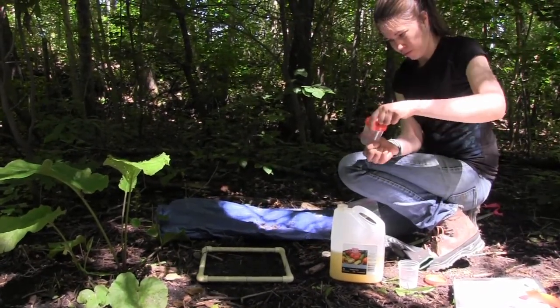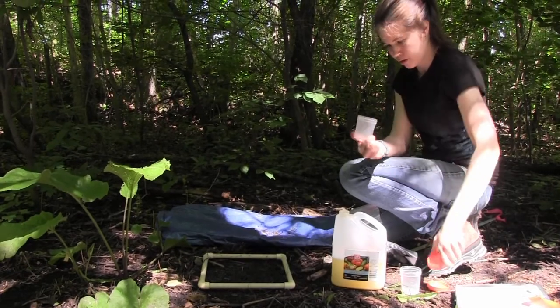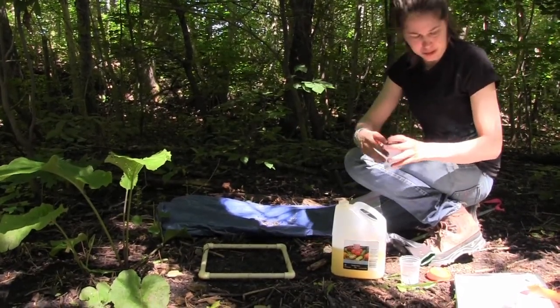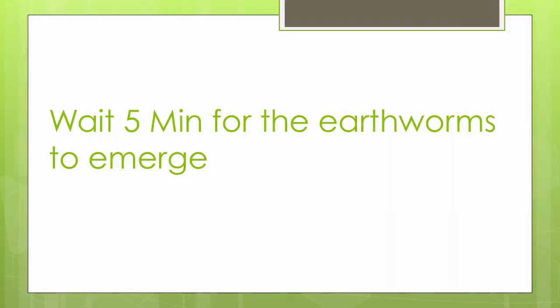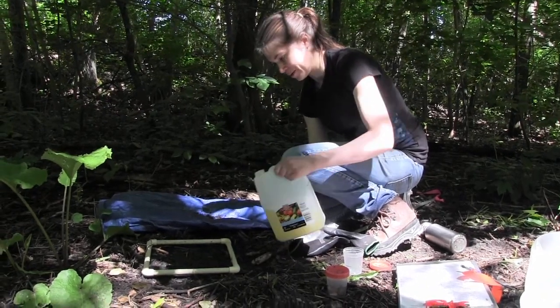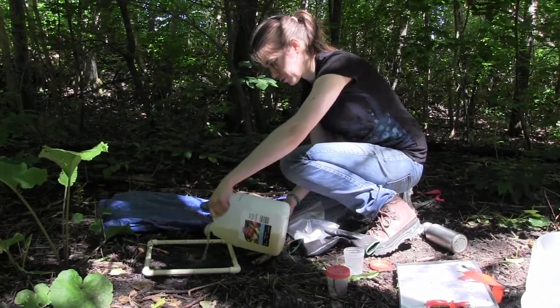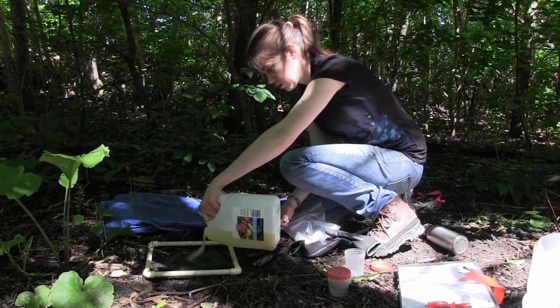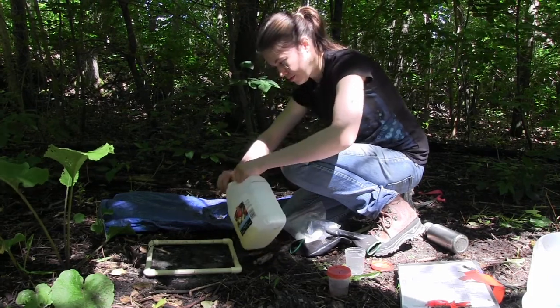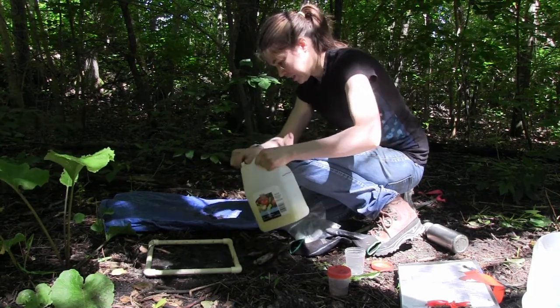And I put the earthworms in a vial filled with water until I can take them back to the lab to identify them. So after 5 minutes, I'm able to pour the rest of the mustard solution on. And shake it a bit more.